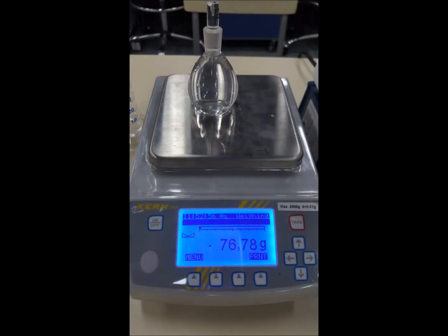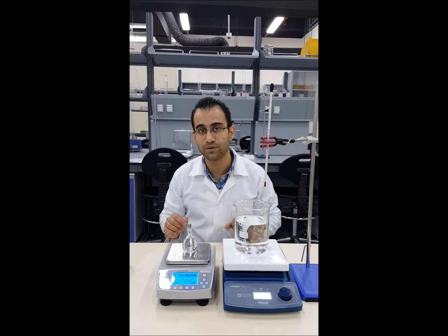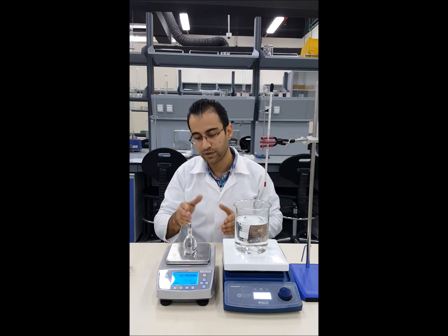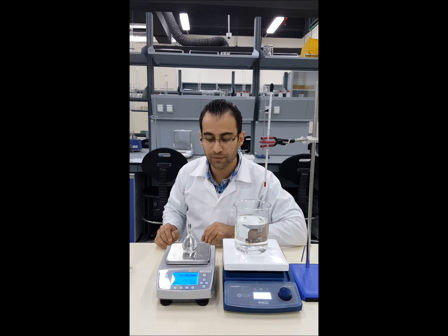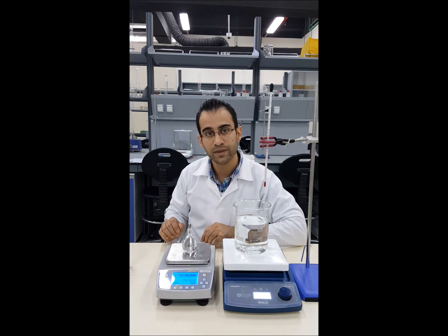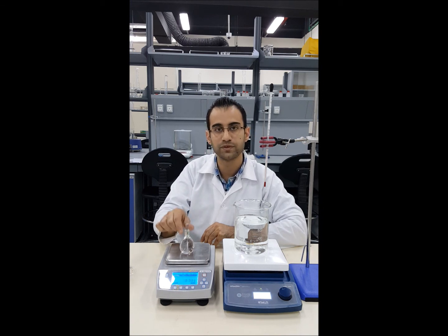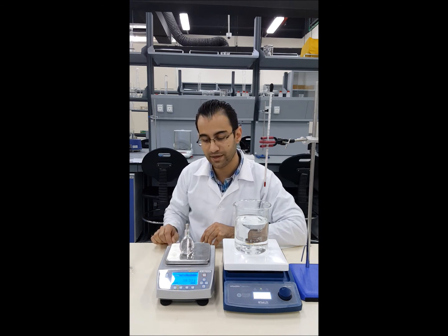Weigh the filled bottle again. The increase in mass is the mass of the water. Subtract the empty density bottle weight from this figure to get the mass of water. We have the mass and the fixed volume of 50 milliliters, so we can calculate the density.